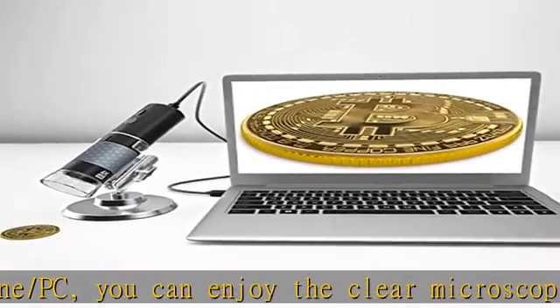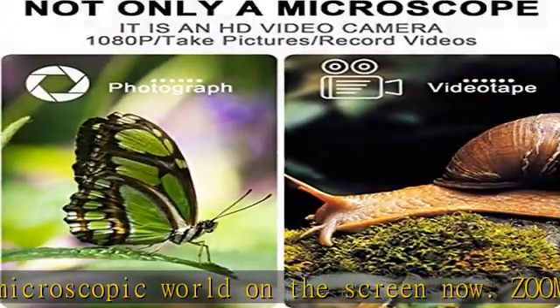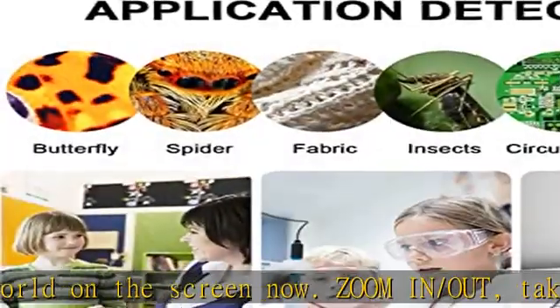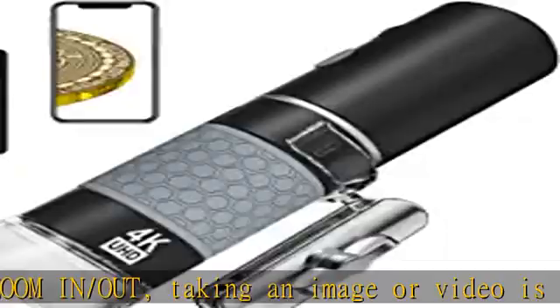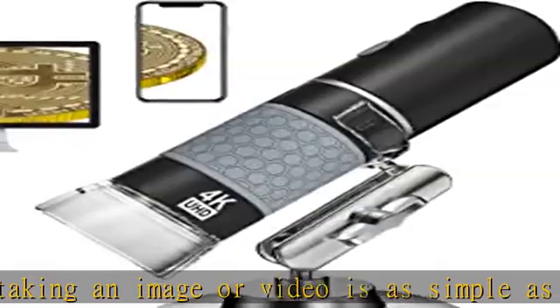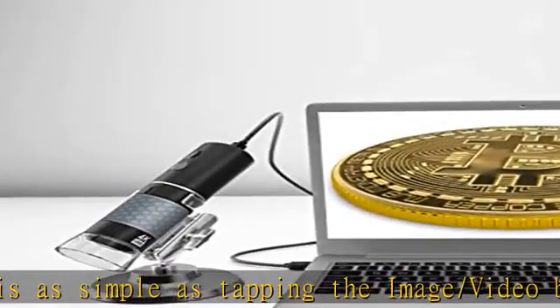Run the app to use. Lightweight and small size allows you to bring it outside easily — very suitable for outdoor use. Broad compatibility: the electronic microscope magnifier uses a webcam chipset and HD CMOS sensor to support nearly any operating system using standard webcam software.